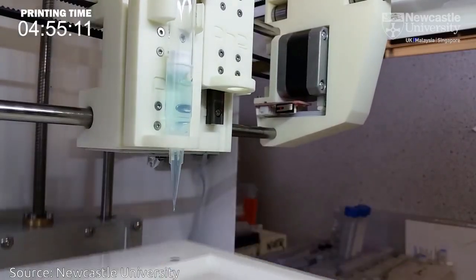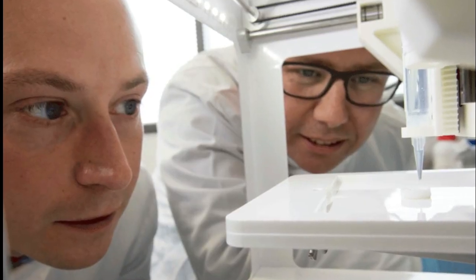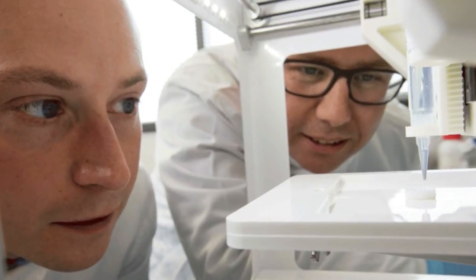Using a simple low-cost 3D bioprinter, the bio-ink was successfully extruded in concentric circles to form the shape of a human cornea. It took less than 10 minutes to print.